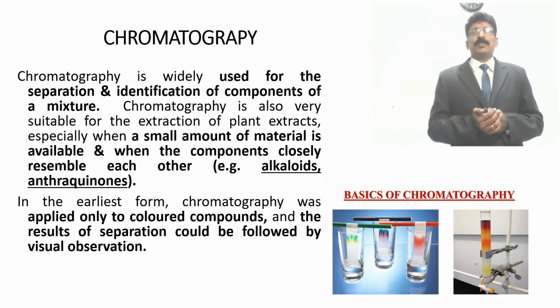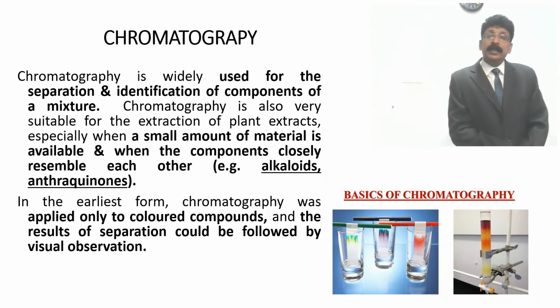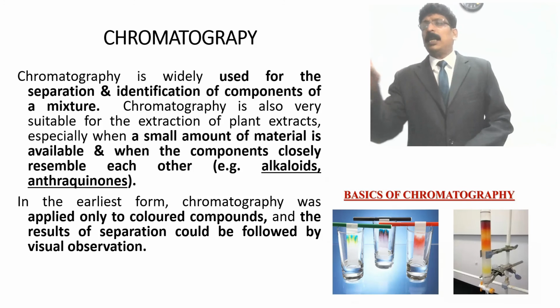And in the earliest form, chromatography was applied only to colored compounds, because visible, colored compounds can be identified.